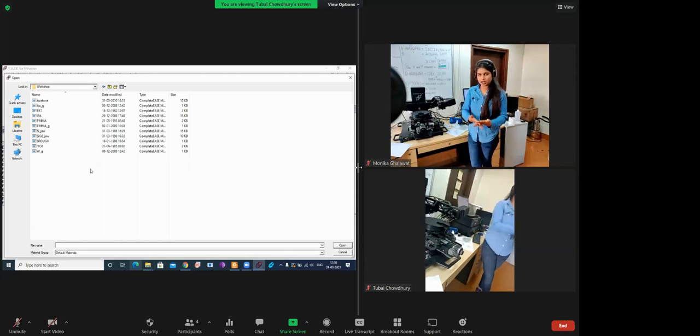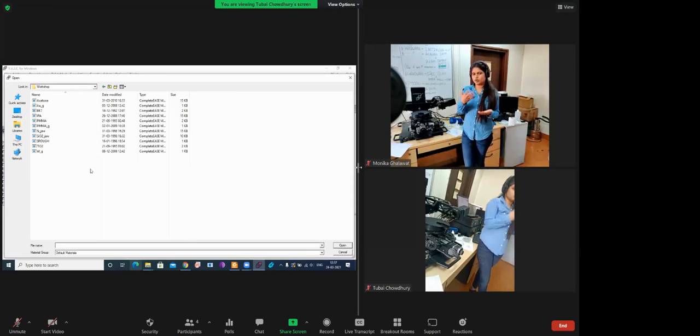If you are making your own film, make sure you have all the knowledge. The best way I will suggest is, whenever you are preparing your sample, take the same kind of silicon wafer, break that from the very big silicon wafer, and always make sure you have the reference silicon wafer with you. Always do the reference first, which will give you the thickness of silicon oxide.